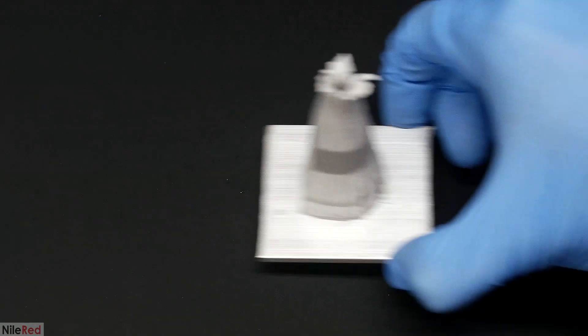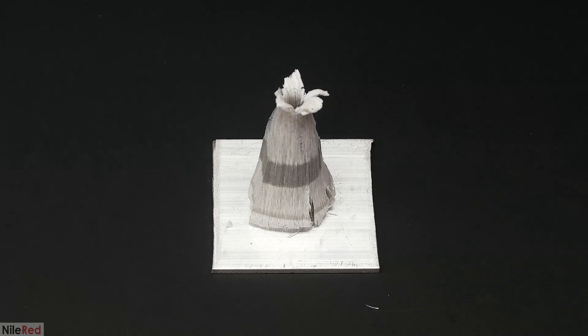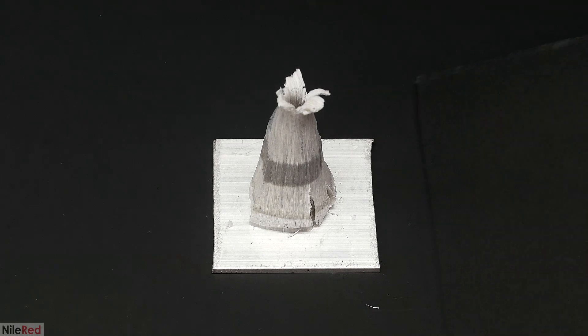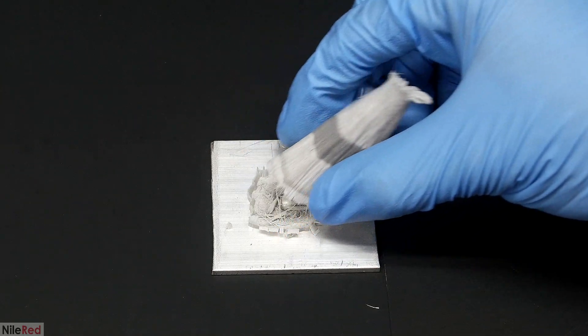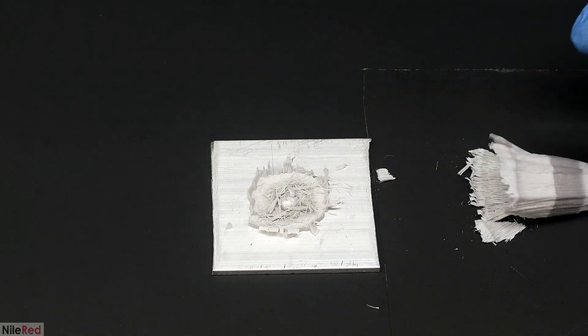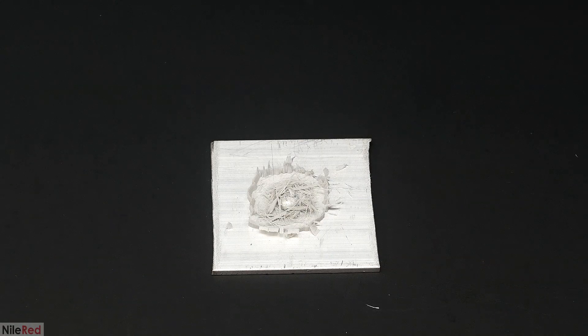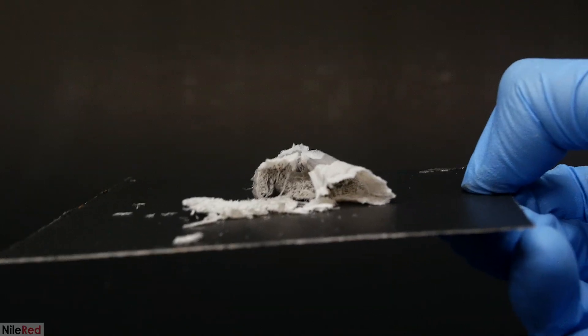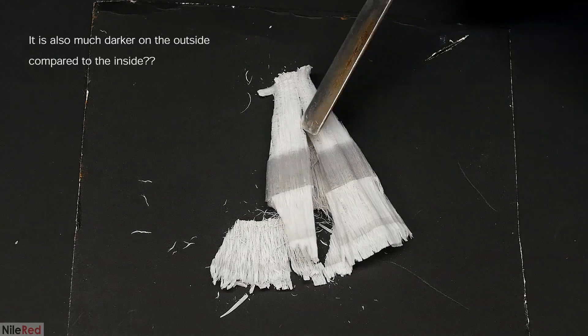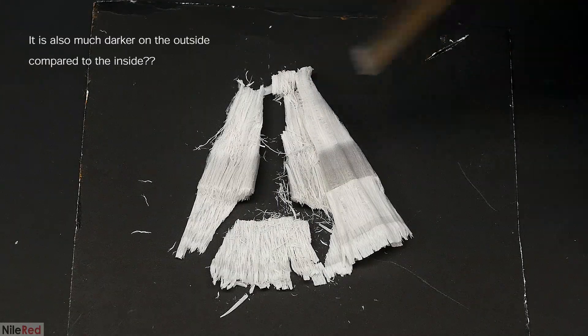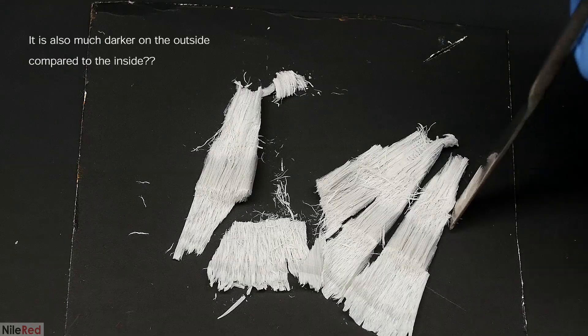The major thing to talk about here are probably the dark bands that formed every time the air was removed. I think this happens because as the fibers grow they pull small amounts of mercury with them. When it's growing at its normal rate it pulls just enough to get a slight gray color. When the oxygen is taken away though, the rate of growth slows down a lot and it for some reason pulls more mercury with it. That's just my theory though, and if you don't agree with it feel free to tell me what you think in the comments.